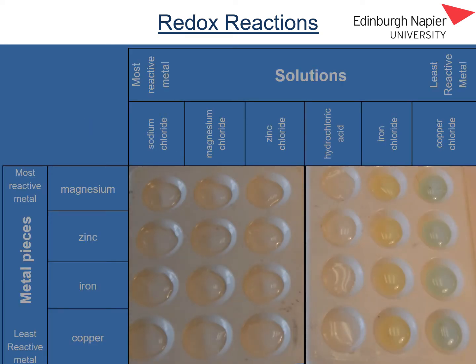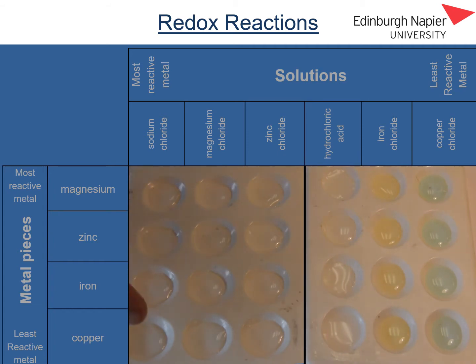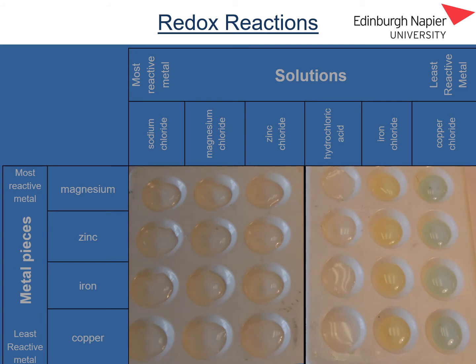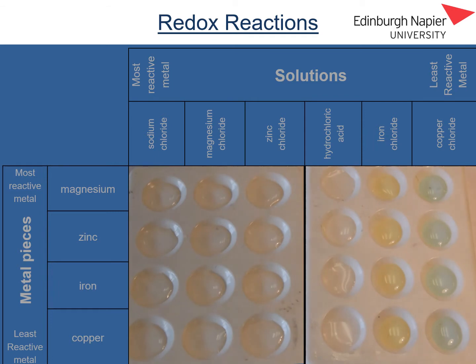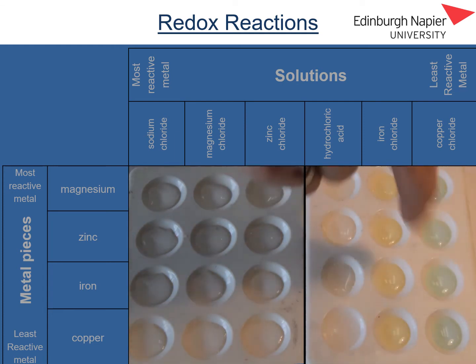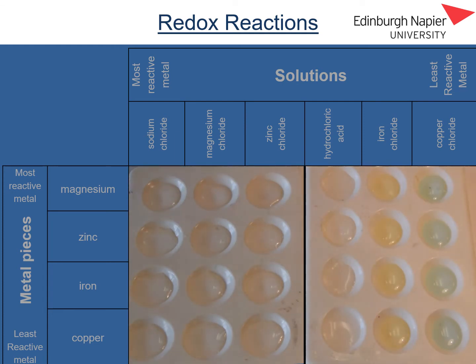In this experiment we're going to look at displacement reactions. In these wells we have sodium chloride solution in four wells, magnesium chloride solution in four, zinc chloride solution in four, hydrochloric acid solution in four, iron chloride solution in four, and copper chloride solution in four.